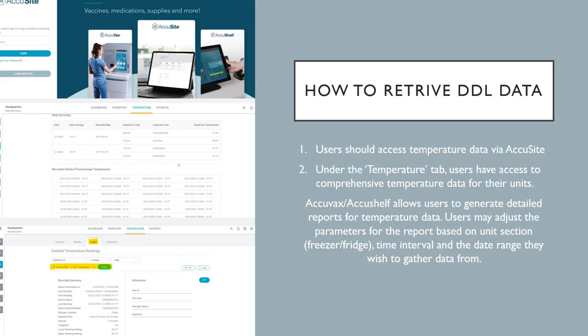Another good thing about this system is it also uses a Bluetooth system, so users are able to get alerts even if they're not in clinic, which helps in addressing any kind of irregularities in the temperature quicker. And it can allow you to alert our program here quicker to temperature excursions as well. Next slide, please.